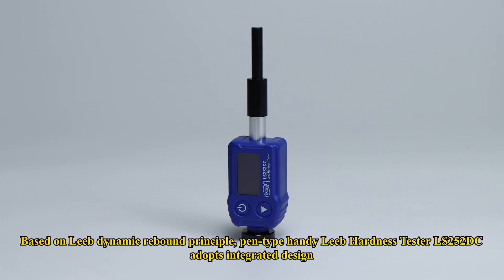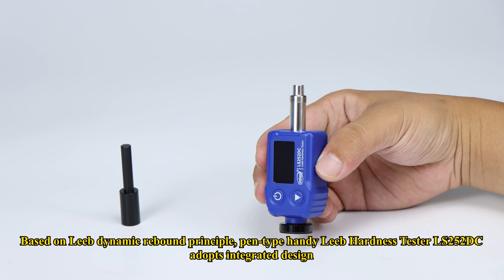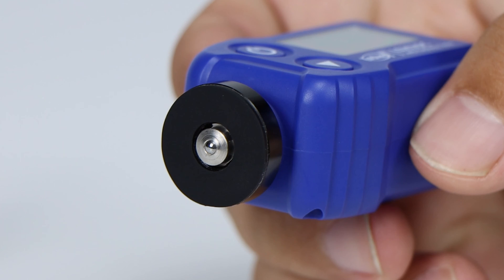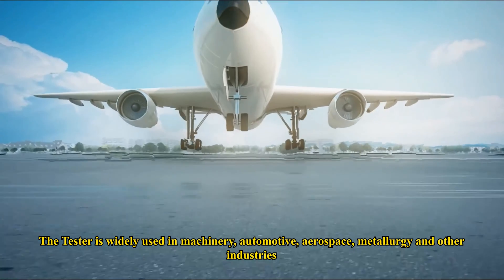Based on the Leeb dynamic rebound principle, pen-type handy Leeb hardness tester LS252DC adopts an integrated design, and the probe employs the impact device DC suitable for testing most metallic materials. The tester is widely used in machinery, automotive, aerospace, metallurgy, and other industries.